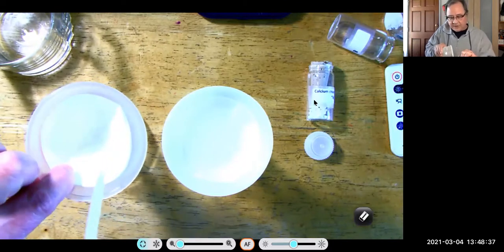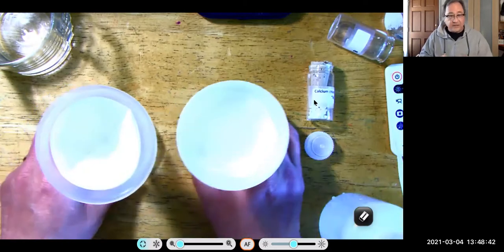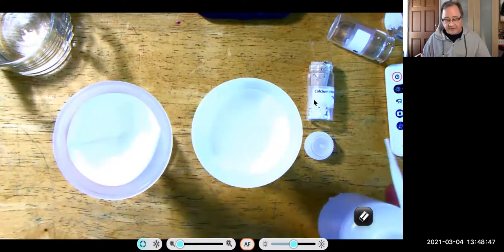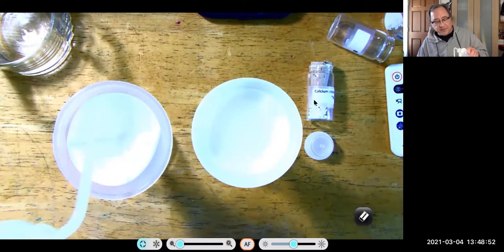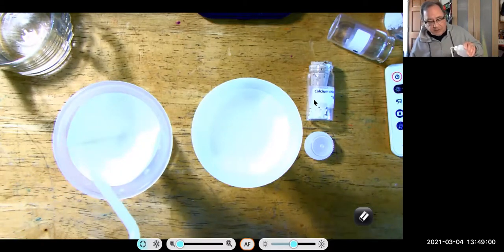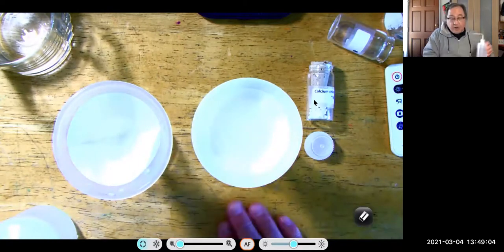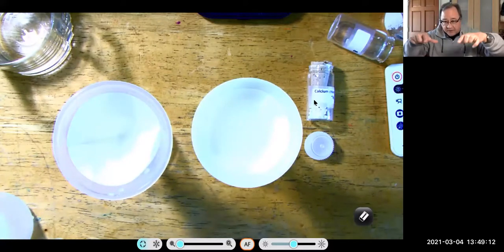And what we're going to do here is pretend that this funnel here is the one that I've been working with, and finally all the liquid has drained out of it. So here what you want to do is carefully squirt the edges of your filter paper at the top with water. You want to do this carefully because you don't want to splash any of the solid in your filter out. You don't want to lose any of that. And so we're going to rinse this from the top down, and the ions should be rinsing down through the filter paper.